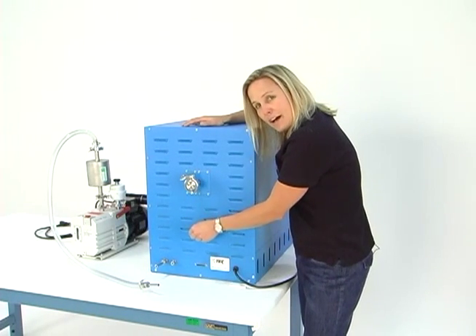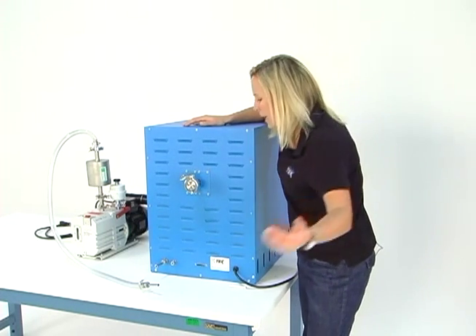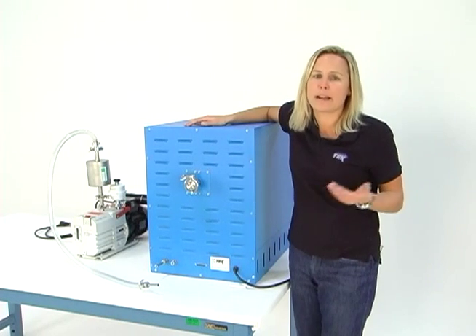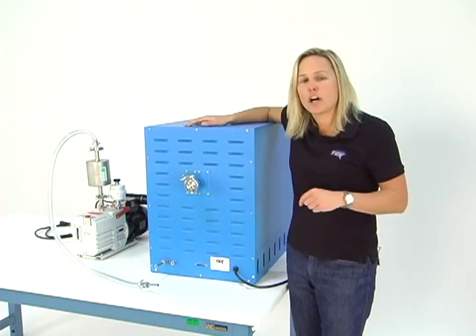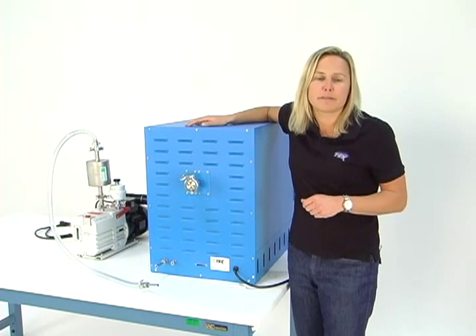That vent valve will allow you to connect nitrogen, argon, or some kind of inert gas, or just allow you to fill the oven up with shop air or ambient air — it's up to you. If you have any questions about backfilling as part of your vacuum process, give us a call. We'd be happy to let you know the reasons why that may or may not be a good idea for your process.